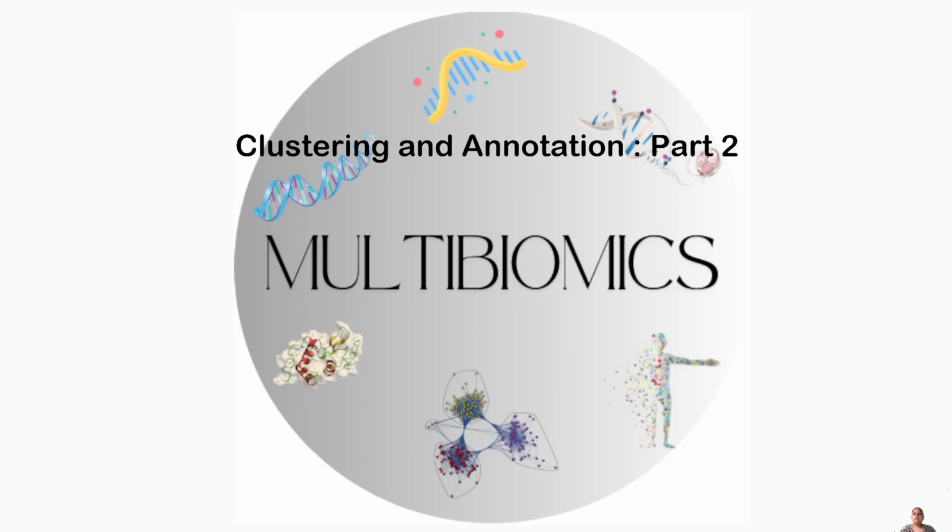Welcome back to part 2 of our single-cell RNA-seq analysis tutorial using Seurat. In part 1, we covered the creation of the Seurat object, calculated key quality control metrics, and visualized them using violin plots. The violin plot that has been generated, you can see here on my screen.